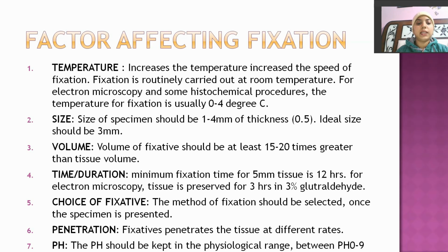Then choice of fixative: the method of fixation should be selected once the specimen is presented. Penetration: fixatives penetrate the tissue at different rates. Then the pH should be kept in the physiological range.